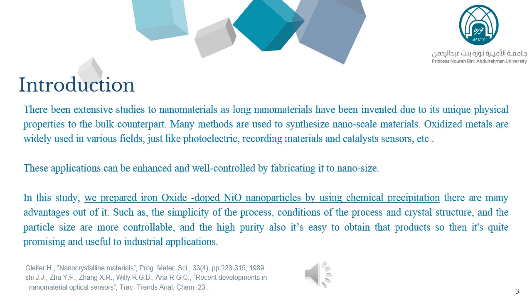In this study, we prepared iron oxide-doped nickel oxide nanoparticles by using the chemical precipitation method. It has many advantages such as the simplicity and the conditions of the process, the obtained crystal structure, and that the particle size can be more controllable, resulting in a quite promising material to be used in many industrial applications.